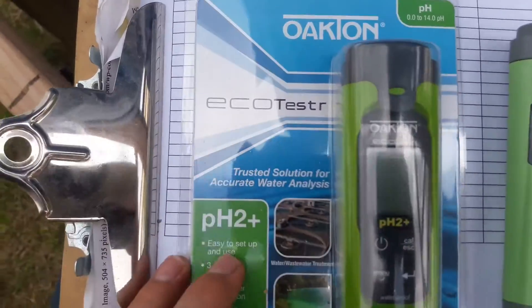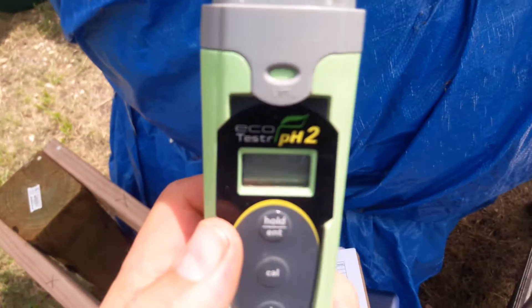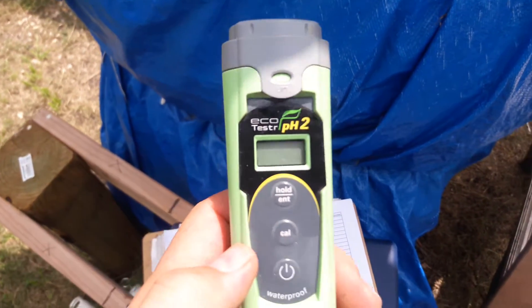Hey YouTube, this is Doug from Green Cabbie, and today we're going to be doing an unboxing and a review of the new Oakton EcoTester pH 2 Plus. We previously did a review of the EcoTester pH 2.